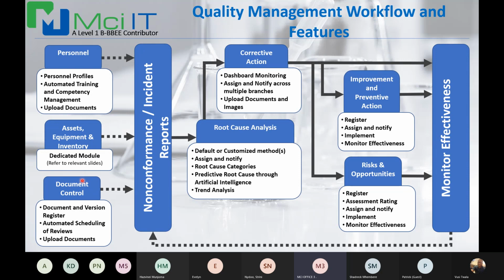And then lastly, in terms of document control, there's a document control module. What does it do? It's obviously a full-scale document and version register. So I'm able to register any kind of document, whether it's internal or external, or even website links in the system.